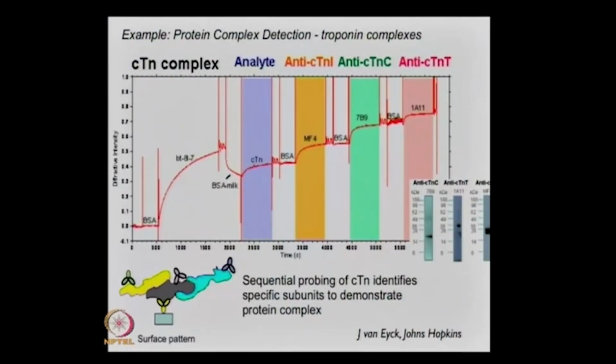And this can be done in how long? This is 5,000 seconds, but it doesn't have to be even 5,000 seconds. If you're not doing kinetics, you can cut this shorter, you don't need that. The comparable technique is a Western blot, and you know how long Western blots take. It will take a whole day, in fact, more sometimes, and a lot of work and a lot of material. So that was a very nice way you can do experiments faster.